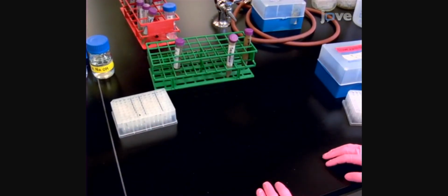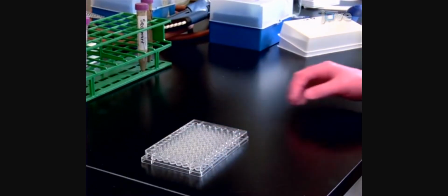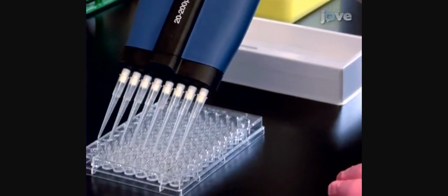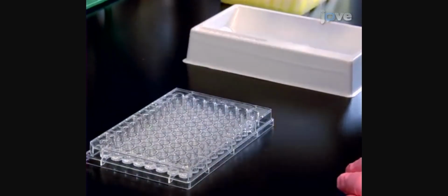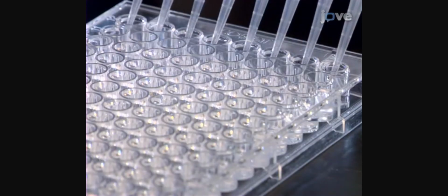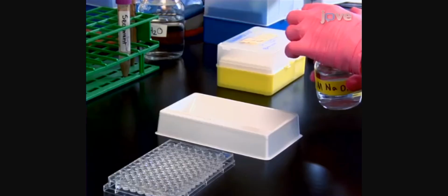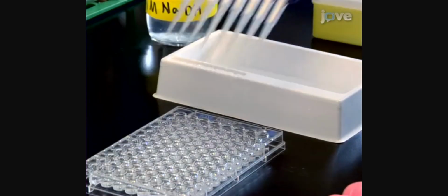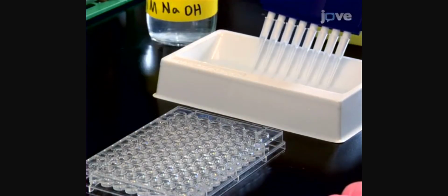Incubate plates at room temperature for 0.5 to 4 hours. Exact incubation time will vary depending on the activity level in samples and the enzyme to be assayed. While assays are incubating, prepare one clear 96-well microplate for each deep well block in order to read absorbance. Pipette 190 microliters of distilled water and 10 microliters of 1 molar sodium hydroxide into each well of the microplate.